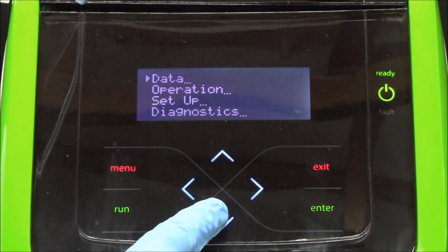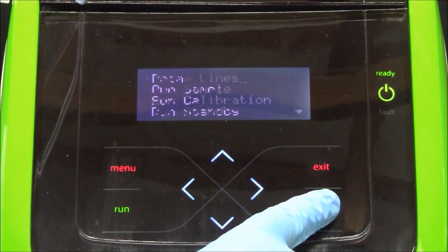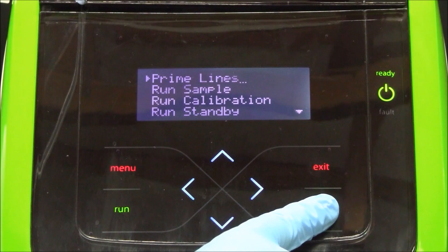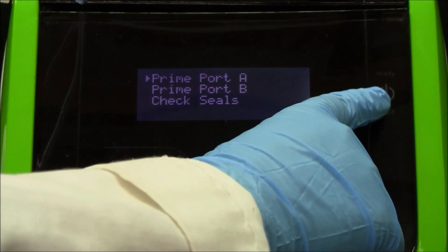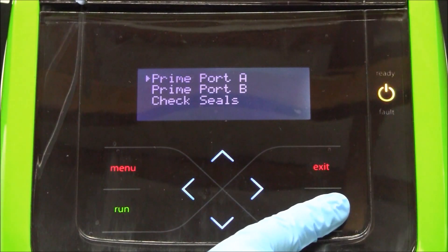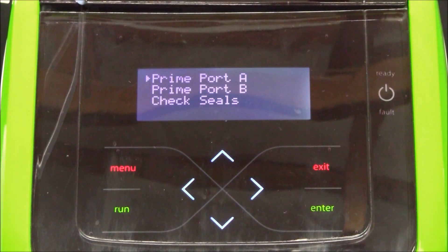In the operation menu, select prime lines. Prime port A three times to fill it with the calibrant solution. Wait for the green ready light before pressing enter. Each prime operation takes about three seconds.